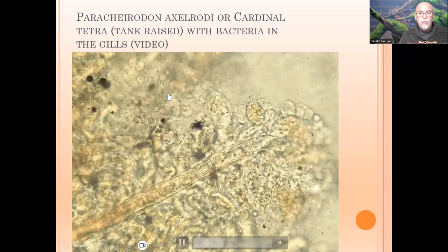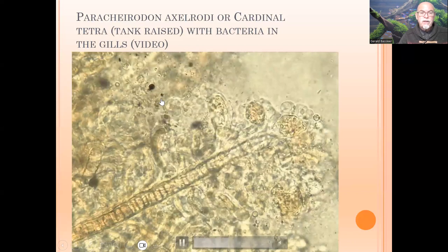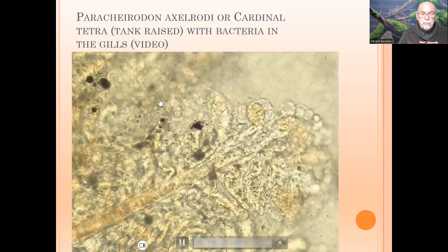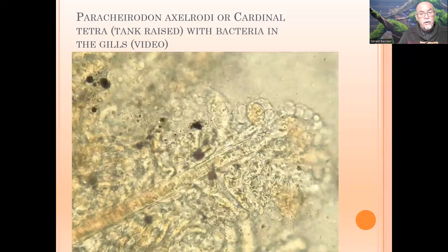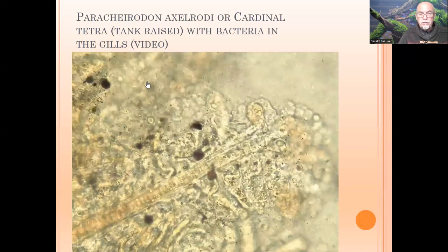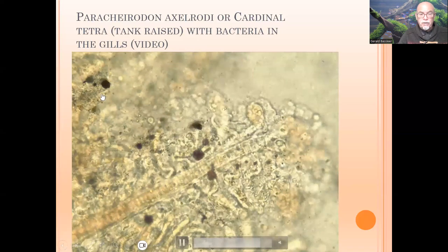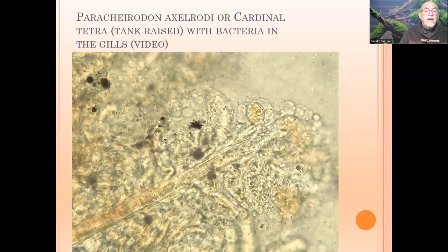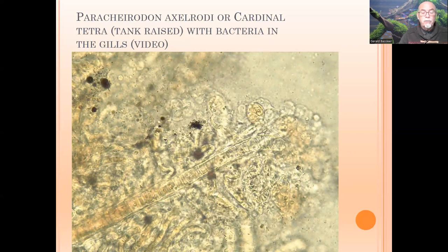We see one little organism moving here. That might have been a flagellate, maybe a parasite. But if it's only one, it's not an infection. That is common in damaged tissue, because here the tissue is damaged by the bacteria. And then you can have some invaders — not particularly parasites, but other little animals, protozoa, that move into the affected tissue.